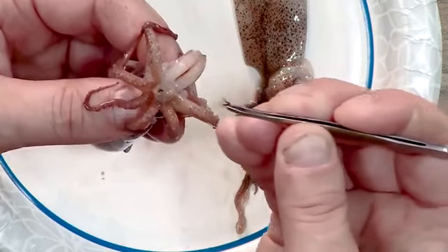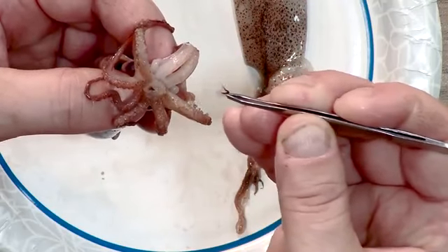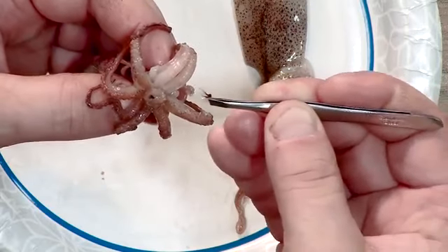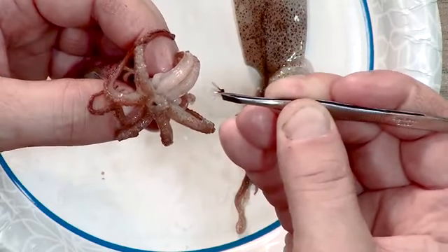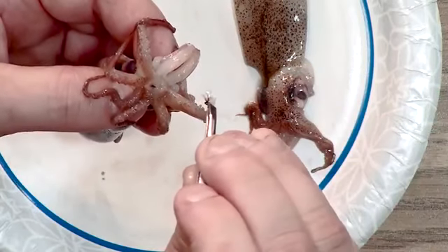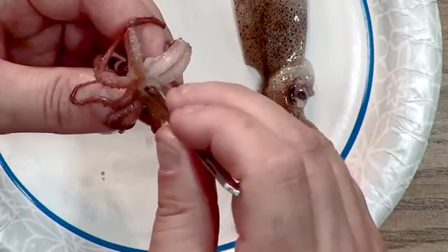And I've pulled it out. Oh, this is great. You can see that really good. See the dark V shape? That is the part of the beak that comes to a point. And then there's a clear cartilage part that connects it. Now, as I said, this comes together, and right now I only have half of it. So I've got to get the other half out.